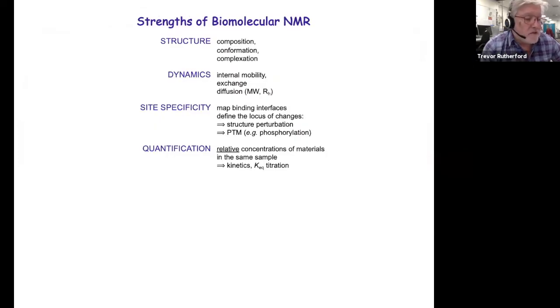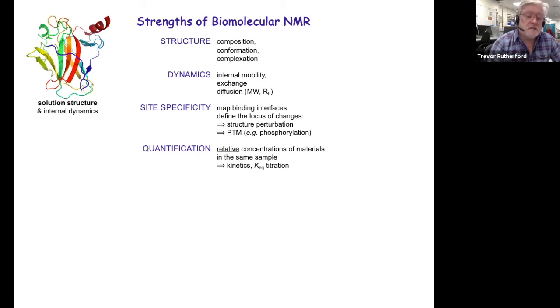So what is it that we've invested so heavily in NMR for? What is NMR going to give us? Well, the primary application of NMR spectroscopy is looking at the composition of molecules. So every chemistry department, certainly in this country, and pretty much most of them in the world, in universities, will have an NMR facility that is used to determine the composition of small molecules after synthesis. But we can also use it in a wider context to look at the shape, the 3-dimensional shape, and the formation of complexes, intermolecular associations.